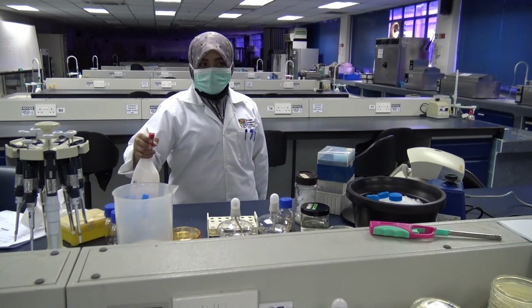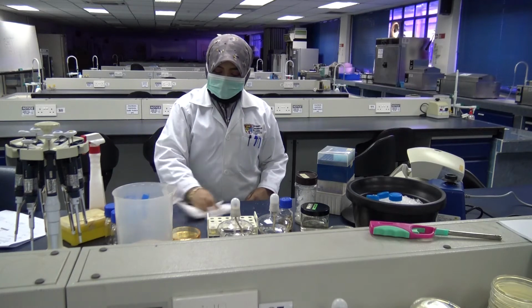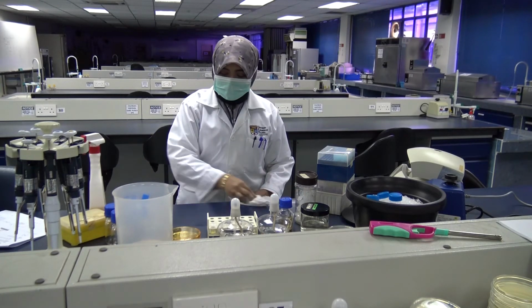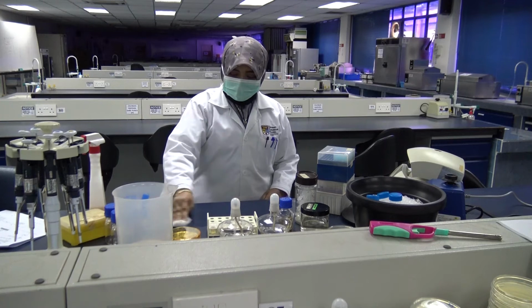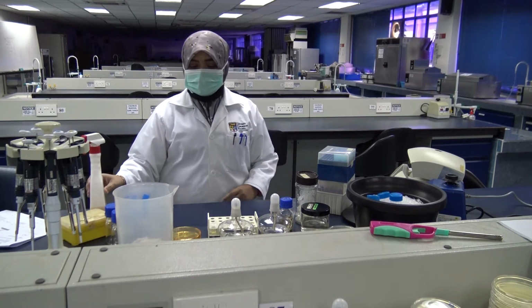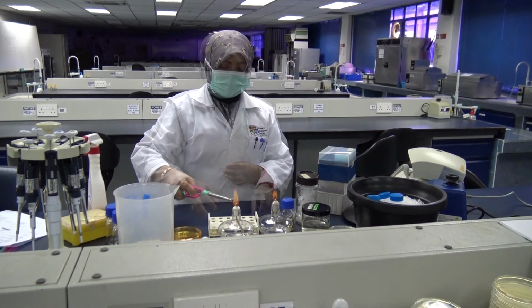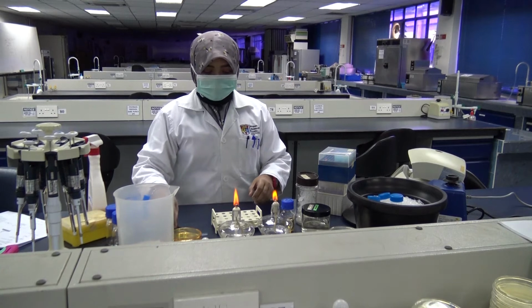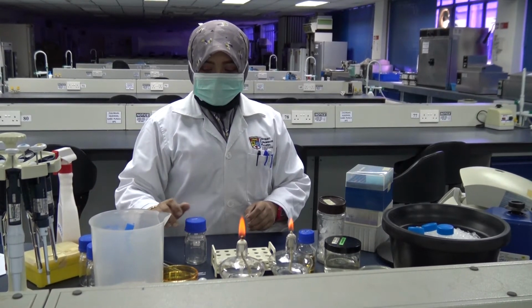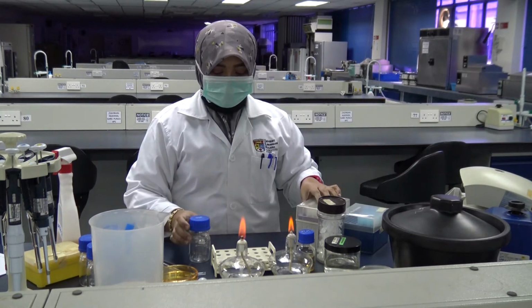The normal practice is to always disinfect your workbench. As you can see, Panzaima is disinfecting her bench by using Dettol and wiping it up with tissue. Once that is done, ensure that your workbench has all the apparatus that you need, a lamp or a Bunsen burner, and you need to light it up. This serves as a flaming source to flame forceps and to create a sterile area to work on.